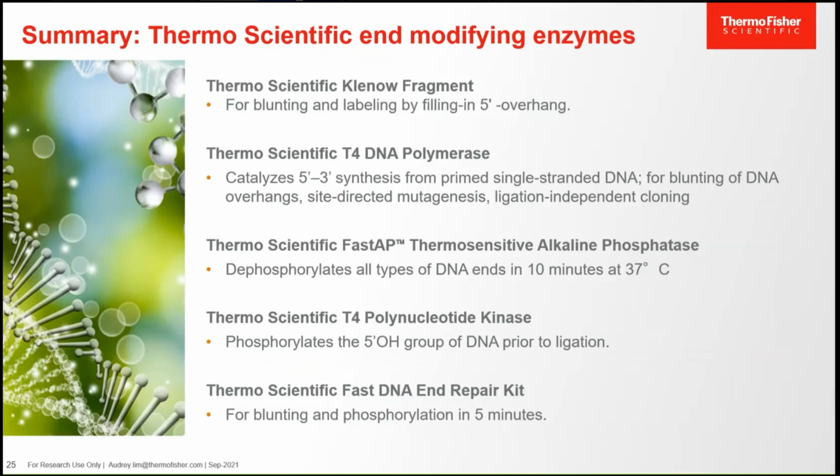Okay, so here is the summary of what I have talked about so far. For blunting, we have the Thermo Scientific Klenow fragment and Thermo Scientific T4 DNA polymerase.